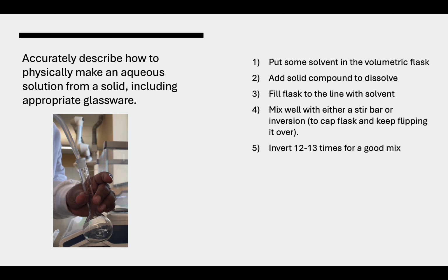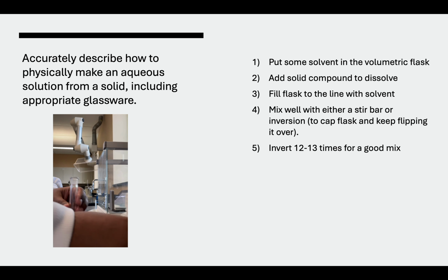Now we just fill up the volumetric flask with a little bit of solvent. And now you can start to add the sugar.